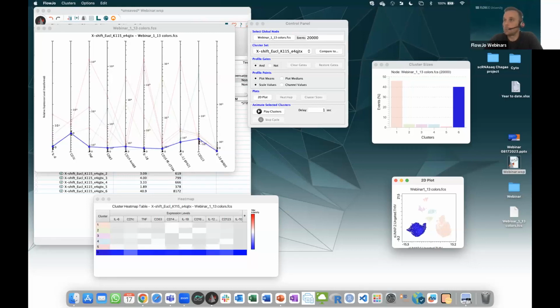Would it be possible to develop a method to view the data with an AI model to highlight the trend, comparing different conditions and different cluster number results? Well, your question is a little bit like what T-REX is doing. T-REX is just going to show you the clusters that changed, and it's going to ignore everything else. So like that, you get it.